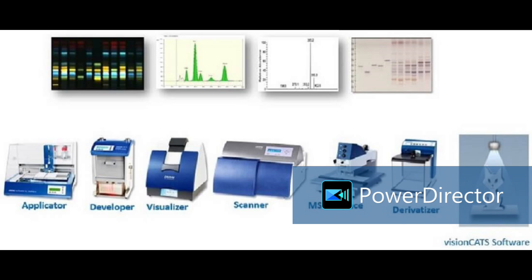Generally, hyphenation happens between chromatography and spectroscopy. Chromatography, such as LC, is for separation, and mass spectrometry is for detection, because LC inbuilt detectors are not capable enough to find trace amounts. We can hyphenate with mass spectrometry, IR, NMR: LC-NMR, LC-IR. HPTLC-IR and NMR are also possible. Hyphenation means addition of different detection techniques to our existing skeleton.